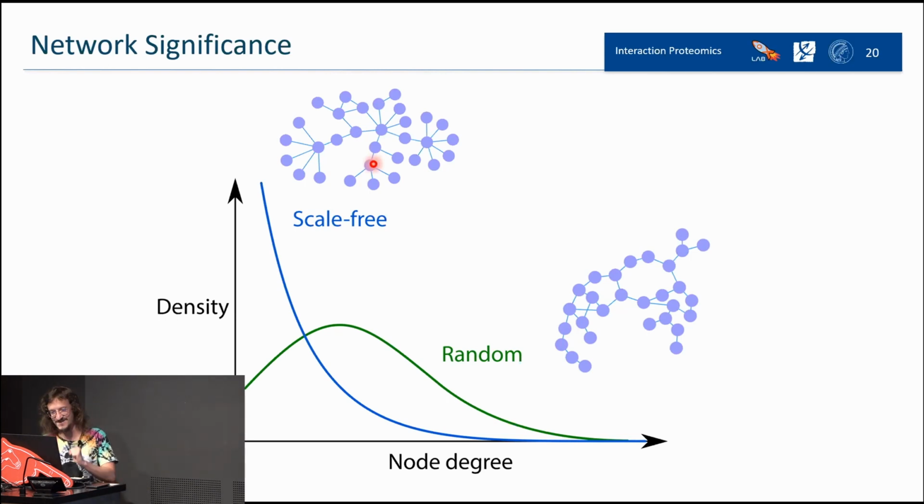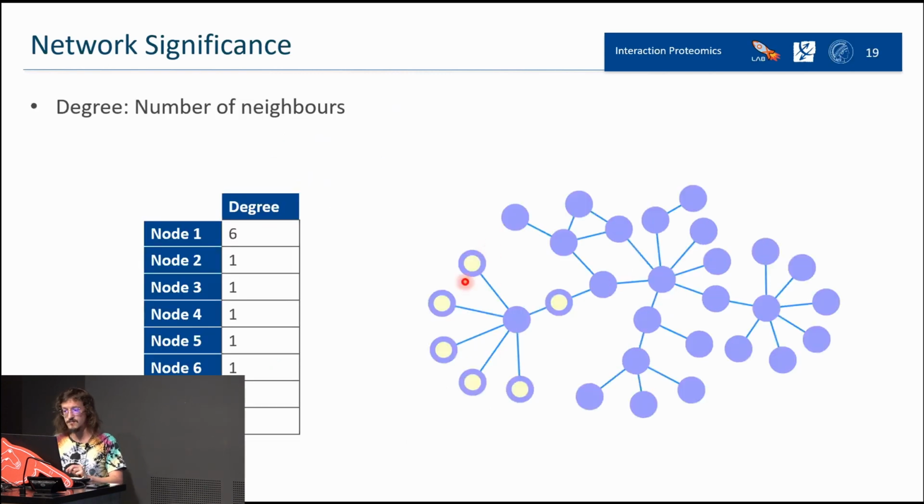You have a lot with just one, as you can see here, for example, all of these have only one interaction, here 2, and all of these, because usually there is a central node that interacts with many proteins. So these many proteins will have only a degree of 1. With the higher degree there are very few proteins, and usually those with a higher degree are your baits.